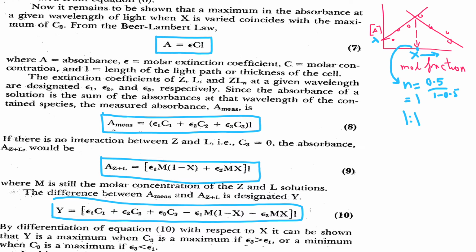So Y is the subtraction of the background from the measured absorbance. So you subtract the absorbance of the nickel solution from the absorbance of the nickel ethylene diamine solution. It will be clearer later on.